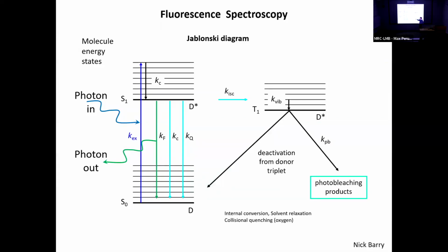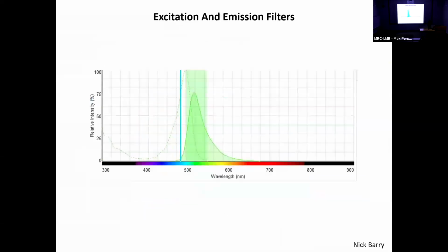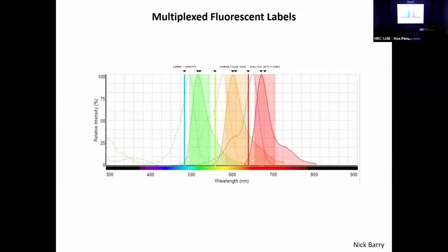All the engineering of dyes is all about limiting all these other parasitic processes so that just the emission is the one that happens most of all. In particular, we want to try and get rid of photobleaching. But as I said, you've got these emission spectra.